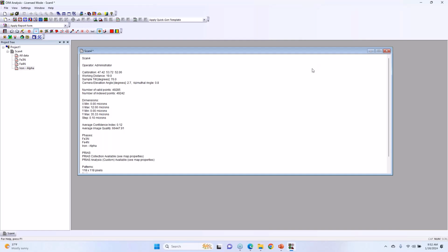There are a couple of pseudo-symmetry problems where we've thrown dictionary at it and we say, yeah, that may be a little bit better than spherical indexing. I haven't done a lot for deformed stuff where I've said dictionary seems to match better. They seem to have very similar performances. I haven't done that often, but you have the option.